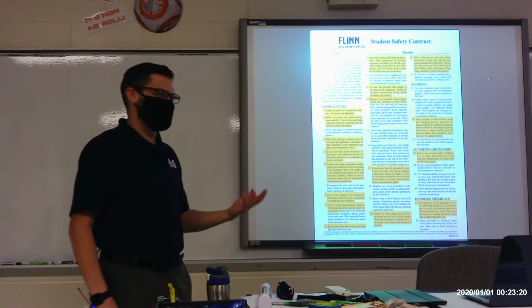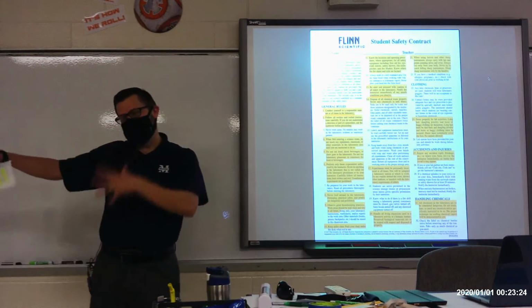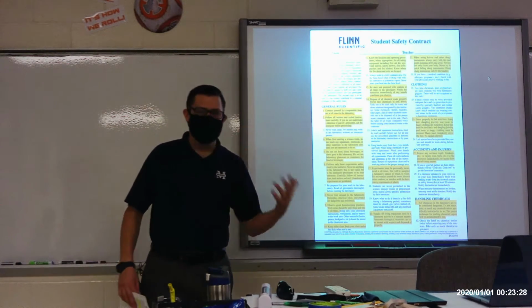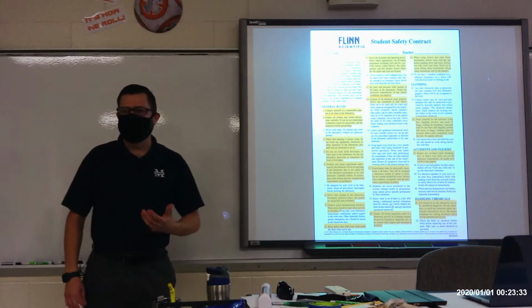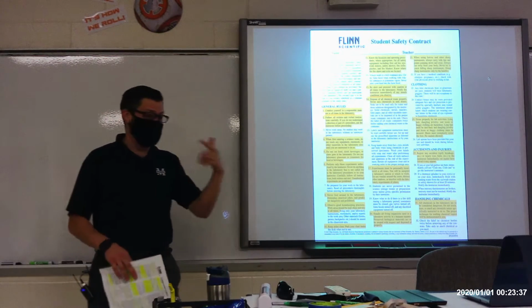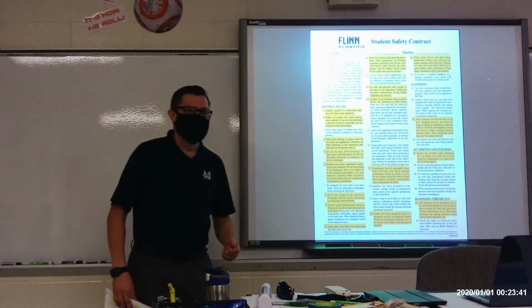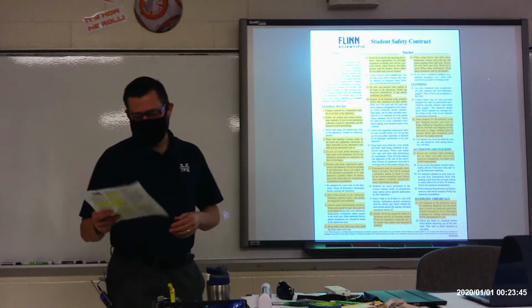When we do dissections, the remains of the dissected specimens we usually put in a separate bag, but I will always tell you how to clean up and how to dispose of things. Again, in this class it's not as important, but when you go next door and you're mixing chemicals together, there are some chemicals you can't put down the sink because those chemicals will dissolve the pipes that hook up to the drain. So you never want to do that.